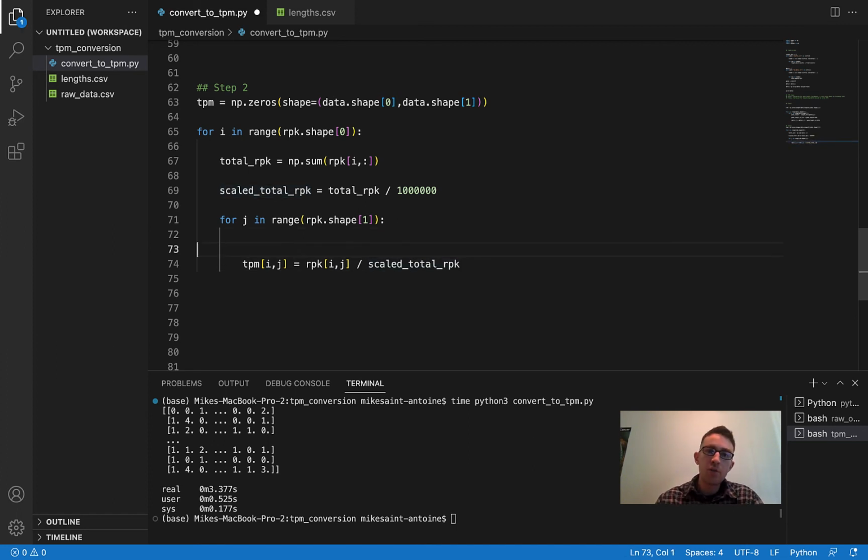Especially in single cell RNA-seq, you might get an entire sample that just didn't pick up anything. So for some of the samples, you may actually be getting a 0 for one of these. I hope you're not getting too many of those, because it's not good if you're not getting any sequences. But in single cell RNA-seq, you may get a couple of these dud samples that don't have any reads or anything.